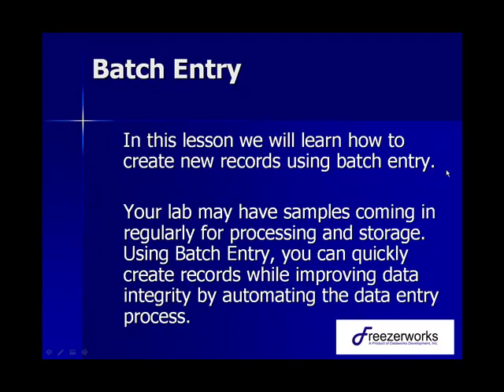Hello, and welcome to our class on how to use batch entry in Freezerworks Unlimited. In this lesson, we will learn how to create new records using batch entry.